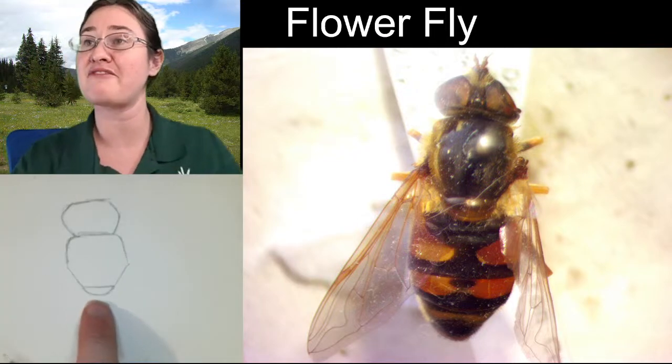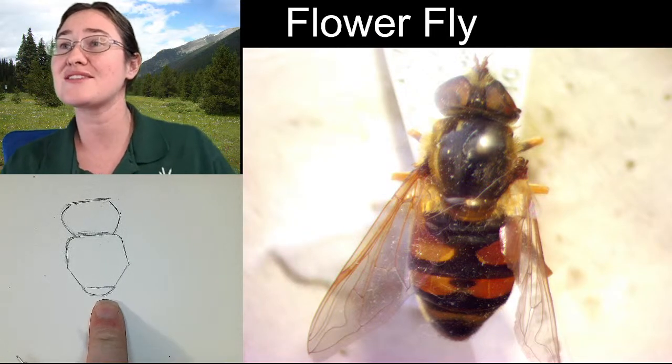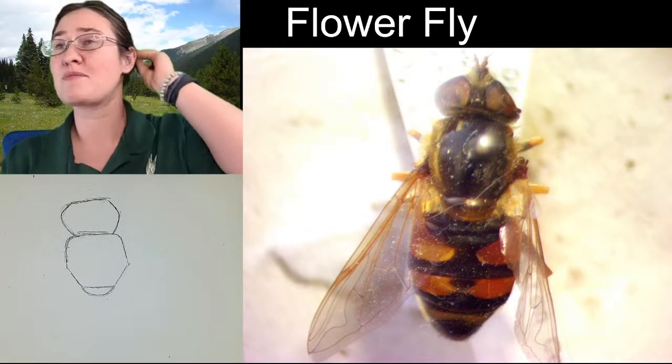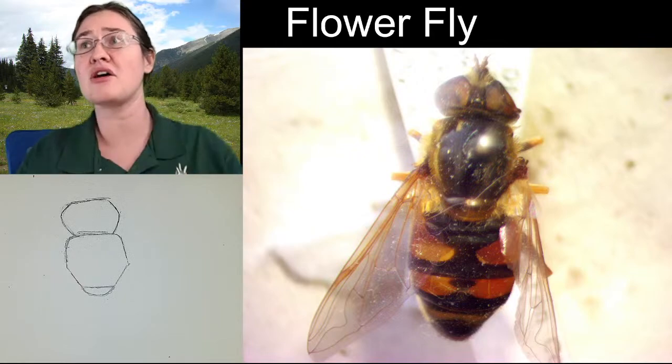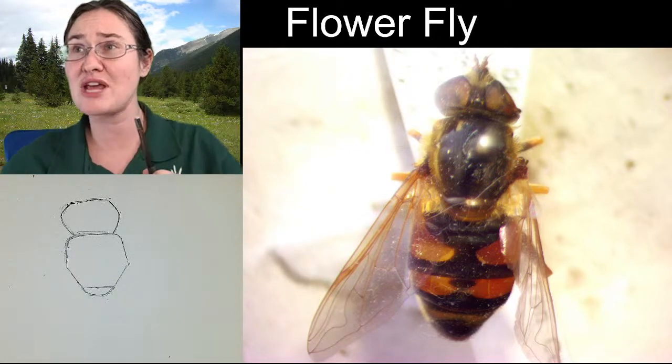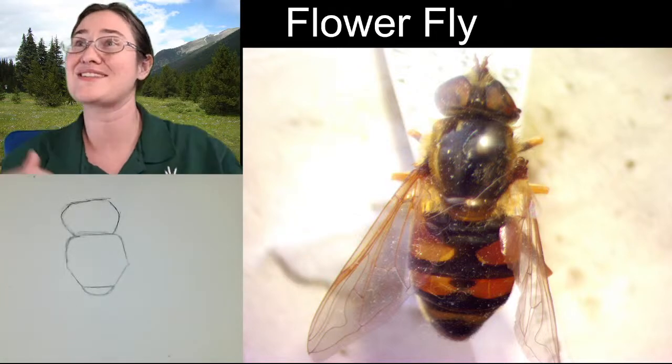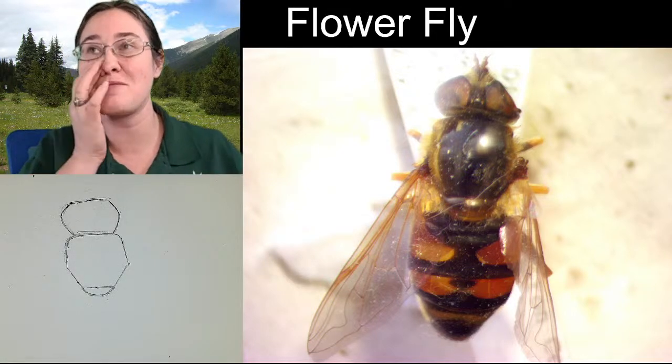And you're going to laugh, but this extra little segment, dude, this is the scutellum. So in beetles, you find the scutellum right between the elytra. It's that little triangle. Well, in flies, they have a scutellum too, and it's generally this little segment in between the wings. Which is funny, because that's what it is on a beetle also.